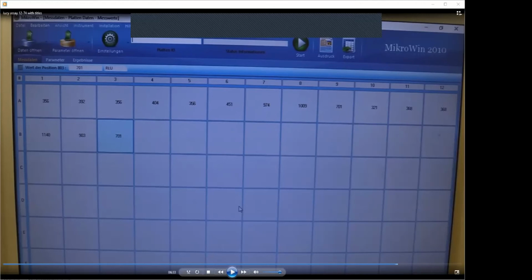when you compare these 3 samples with these 3 using lithium chloride. And also, what is even more important from the biological point of view, if we overexpress beta-catenin, which is the main player in the Wnt signaling pathway, you see also an increase. So the TOPflash reporter in our hands worked.